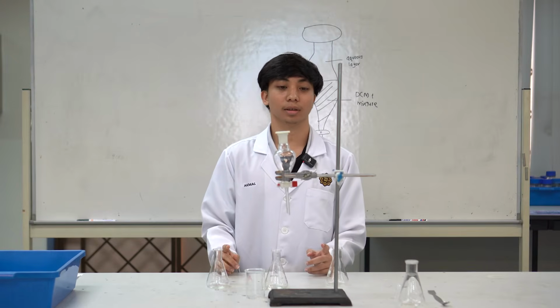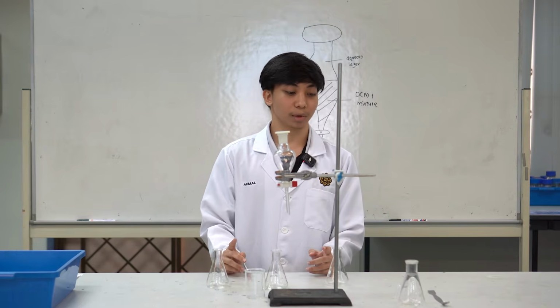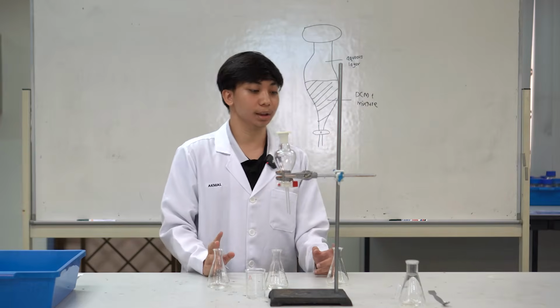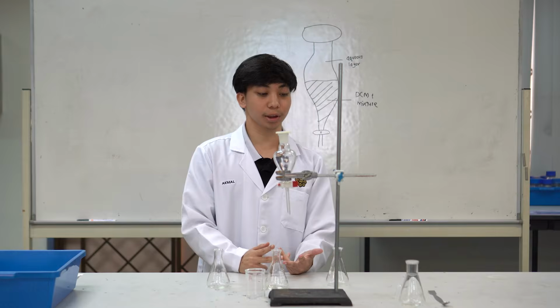And then next, for the result, we will recover the three compounds, which are acid, base, and neutral.